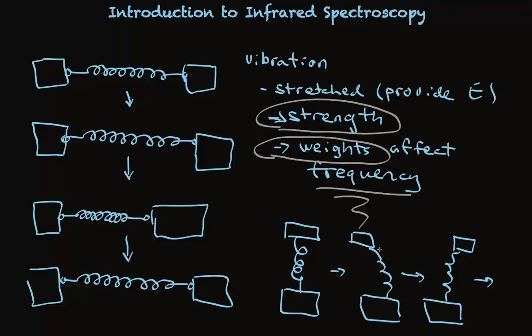So there's a second kind of vibration that we could be talking about. It's sort of a wagging kind of vibration. And both of these kinds of vibrations happen when you shine a certain wavelength of light onto an organic molecule. Because both of these types of vibrations can be occurring simultaneously, IR spectra can be a bit complicated. Let's take a look at a spectrum.